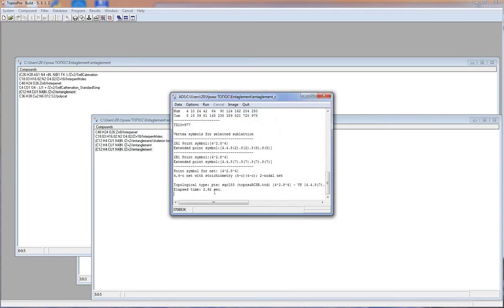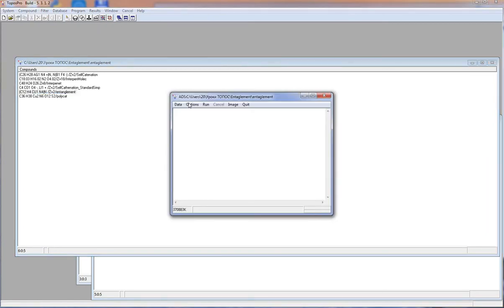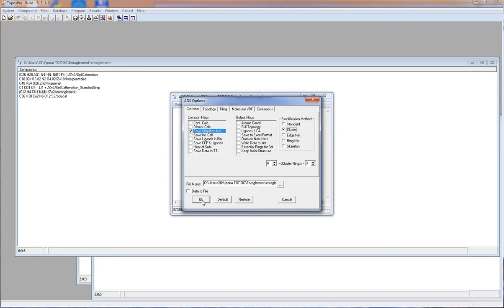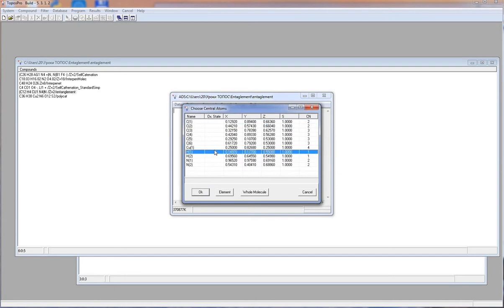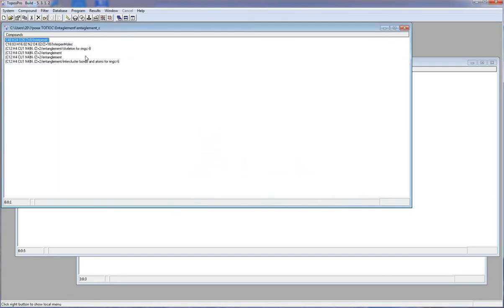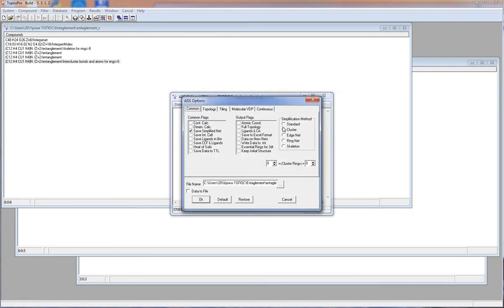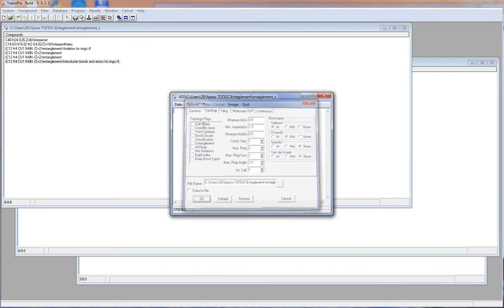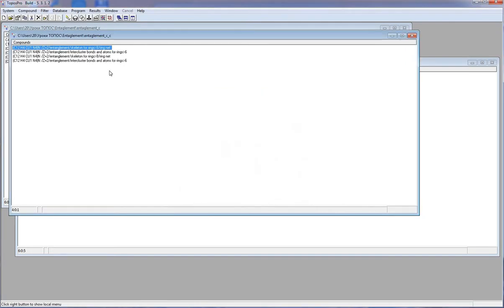Also, I may do the cluster simplification. I run ADS, Option, Save Simplified Net, Simplification Method, Cluster. Now I should make the standard simplification for the molecular packing, connected by hydrogen bonds. You can find a more detailed information about the cluster simplification in our lesson Special Methods of Simplification.